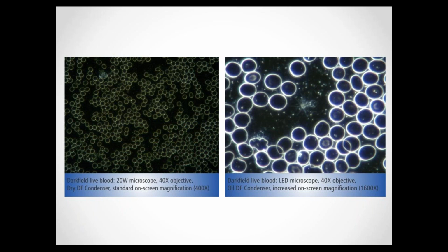Well, being able to analyze blood properly in dark field really plays a critical role in live blood analysis. There are some anomalies that can only be seen in bright field, and some that can only be seen in dark field. That is why we always take a look at a blood sample in bright field first, before going over to dark field. However, I usually spend less than 10 minutes on bright field because there's so much more that we can see in dark field. Often the anomalies seen in dark field are really fundamental to the case, and they determine the direction taken in terms of treatment.